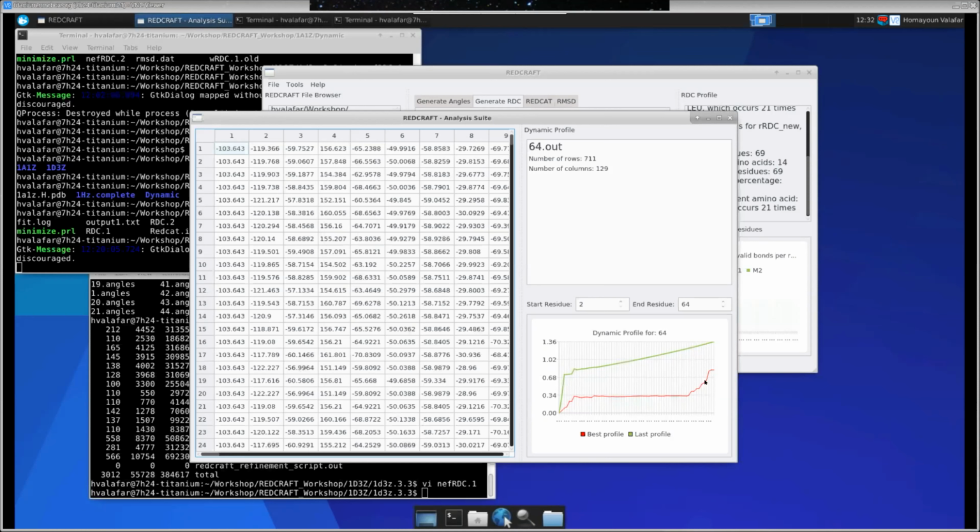Oh, okay. As you go along the chain, I see. Exactly. Whereas here, it just continuously shows discrepancy, and that discrepancy plateaus, but it continues. Yeah. This is an indication of dynamics. Wow. And at this point, the question is, is it dynamics? What is the magnitude of dynamics? And what is the mode of dynamics?